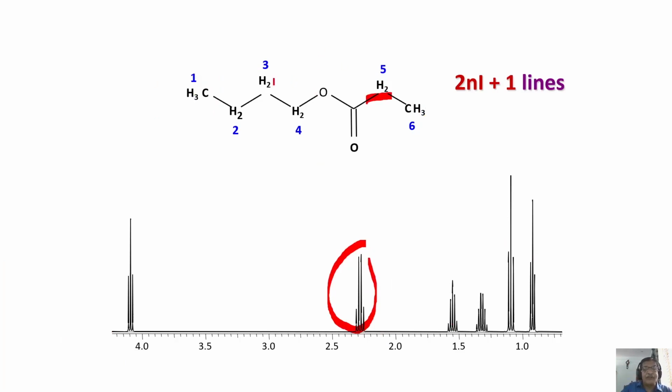We will go further. Now, we will come to this ring. This CH3 has to be a triplet because of this. Correct. So, now we identified two triplets. Alright. But one interesting thing happens. If you carefully see the triplet separations, see this triplet separation.